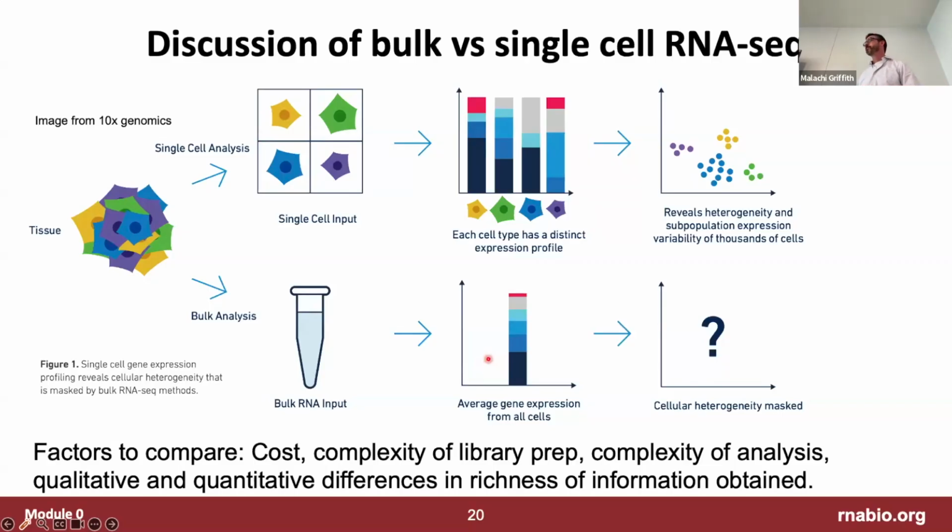Yeah. Probably one of the issues too with single cells is the lower throughput, especially with the RNA abundance, since you're looking at it from a singular cellular level. So even genes that were moderately expressed, because you did bulk with many cells, you could still capture some differential gene expression that is somewhat changing, but especially with single cells at a time, it might be harder to have that. So you might have less of a dynamic range of differential gene expression that you can look at from your results. Yes.